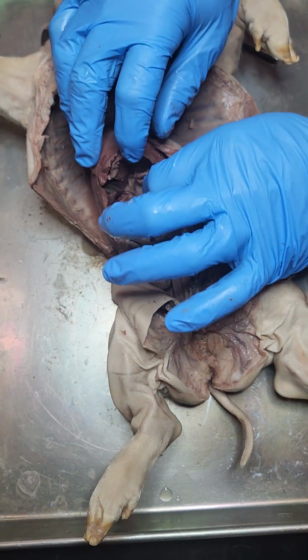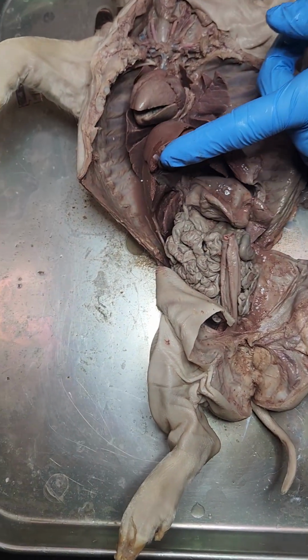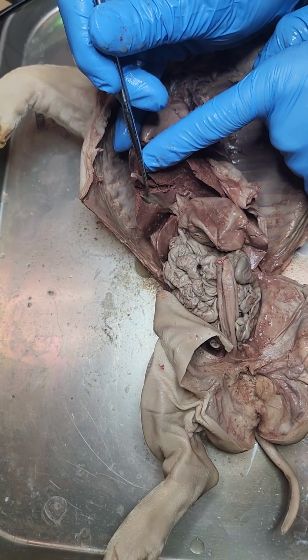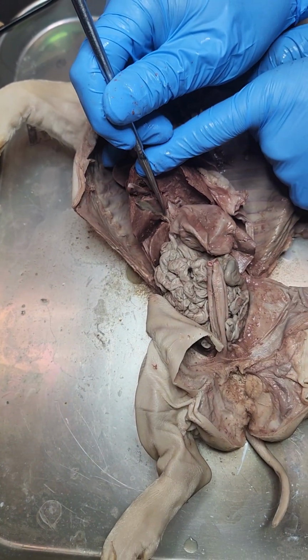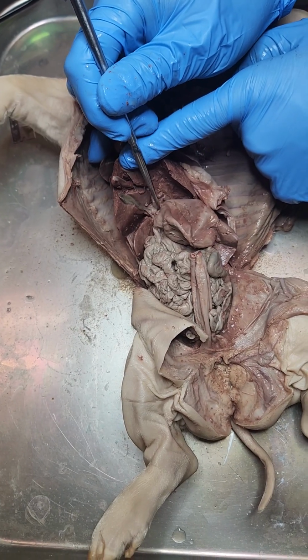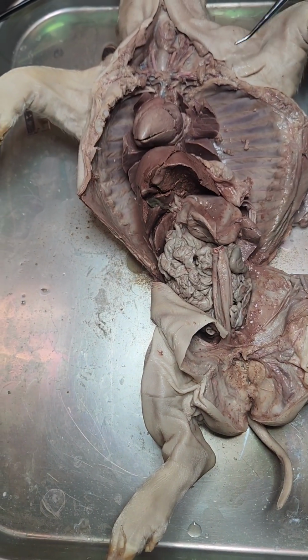Stomach's this pouch right here. Liver's right here. Gallbladder, back side of the liver to the right, there's a little pouch, a green pouch. That's it, that's the gallbladder. Follow it down, and you'll see a little tube where it dumps into the stomach. That's a common bile duct. Okay, that's how bile gets into the stomach, which is a digestive enzyme.